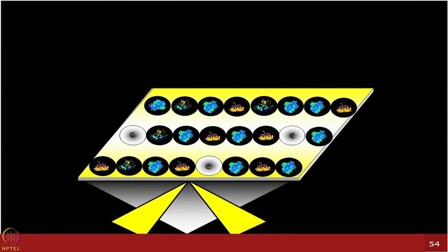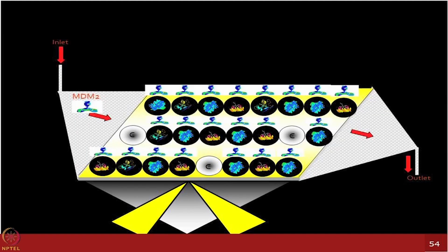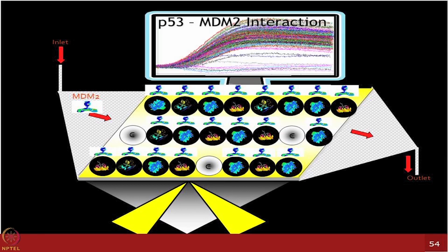The next experiment which was planned was more of a high throughput experiment, and very challenging to do on the prototypes we had available. One of the companies in Cambridge at that time gave a lot of clones of p53 mutants. These are all hotspot mutants of different p53 regions, to test how the MDM2 protein binds to the wild type of p53 versus different mutant forms of it. This cartoon image shows we are trying to look at 144 spots binding, and how that can be measured simultaneously.